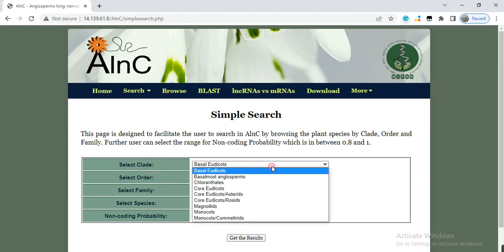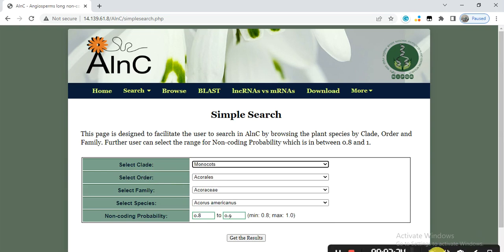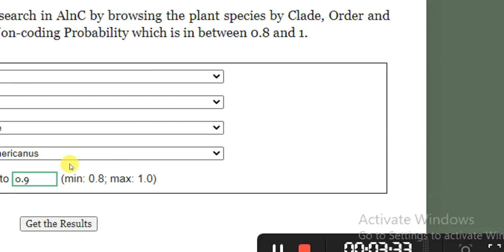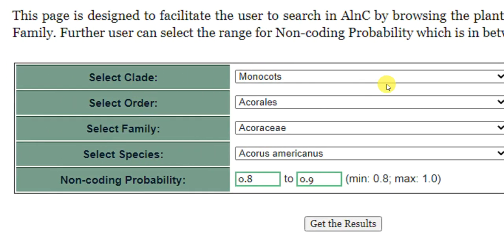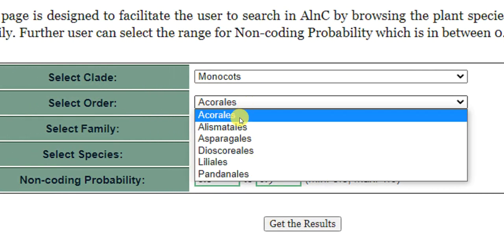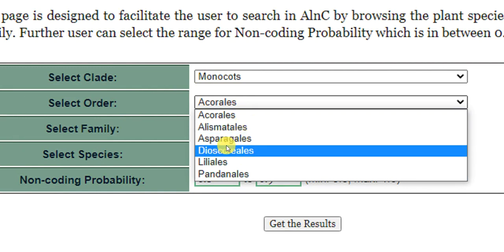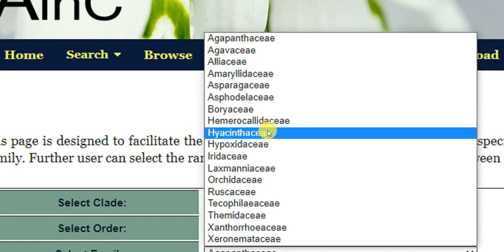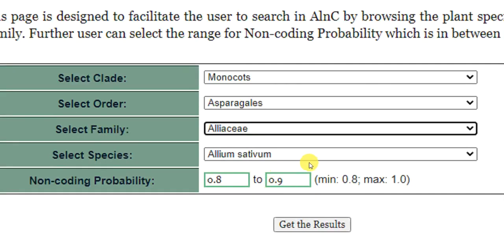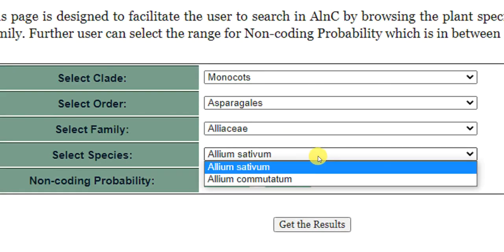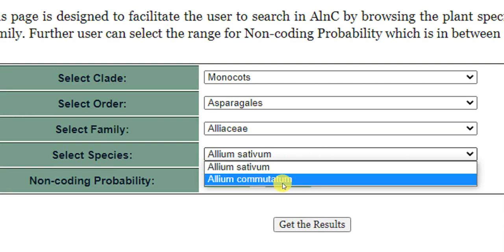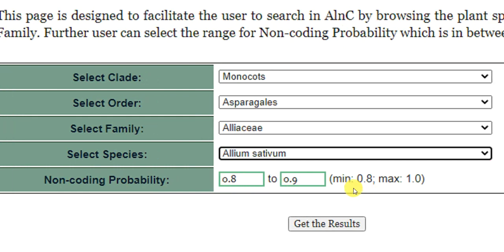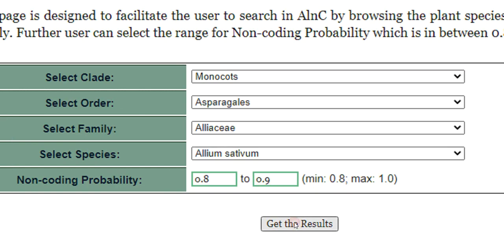Here is the clade selector. For example, we select monocots. Within monocots there are different orders — for example, we can select the order Asparagales. From there, there are many families; we can select Alliaceae and search. The species in the Alliaceae family include Allium sativum and Allium commutatum. We select Allium sativum, and for probability you can keep it as is — the minimum is 0.8 and maximum is 1. Then click 'Get Results'.